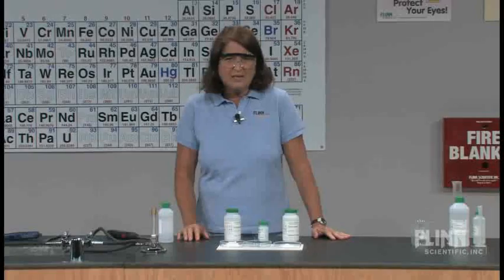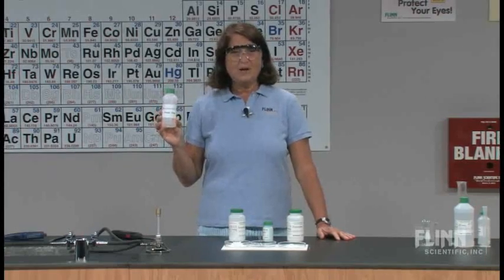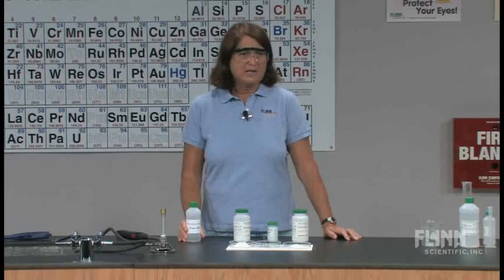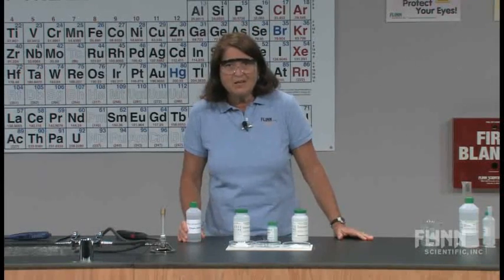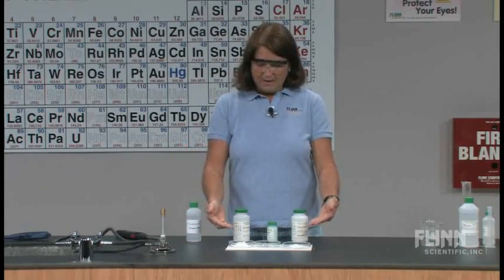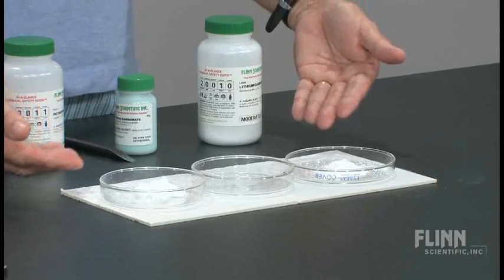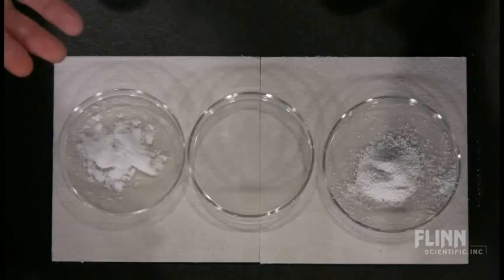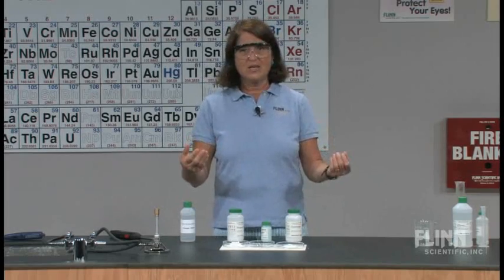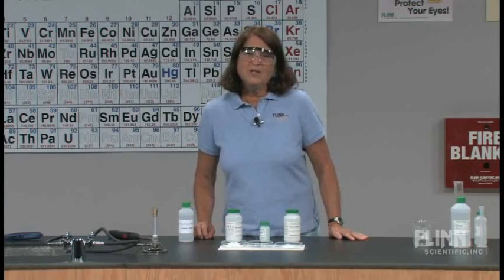You might be thinking, what's she going to do with a carbonate that's going to give her a flame test? Well, I've got a great little bottle of vinegar here. When I react vinegar — this weak acid — with a carbonate, I'm going to produce carbon dioxide gas. What happens is that with the powders in the Petri dishes, the rising carbon dioxide is going to lift some of these particles up so that the electrons can be more exposed to the heat from a Bunsen burner flame. And that's going to excite the electrons, producing a really good flame test.